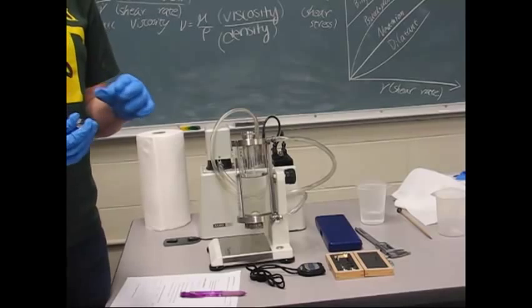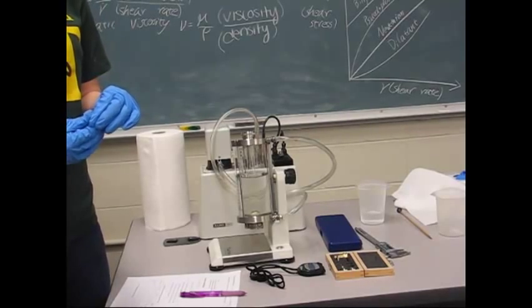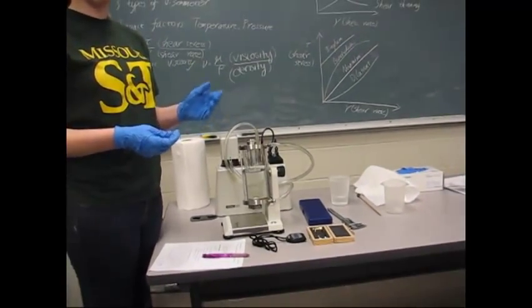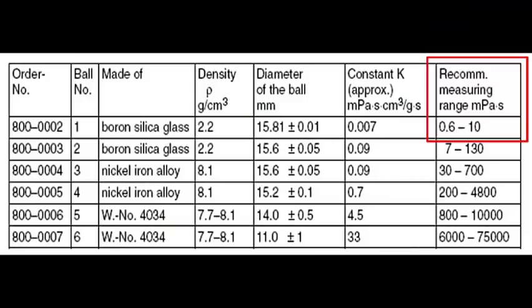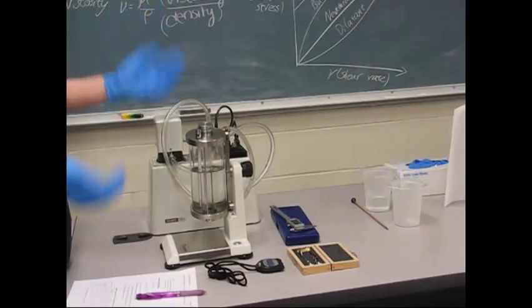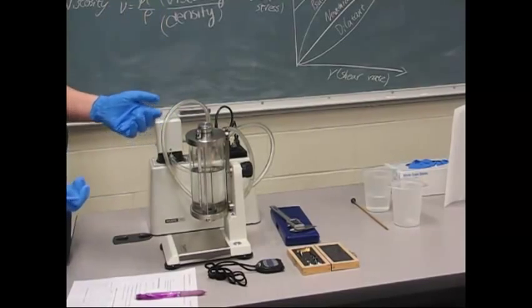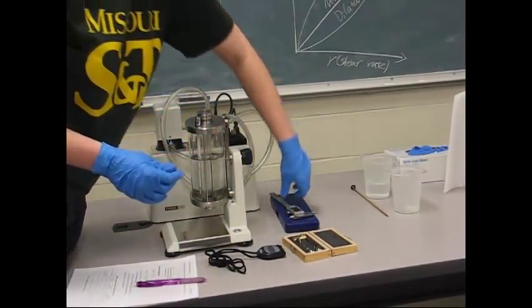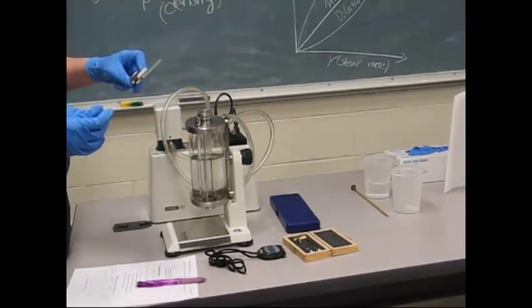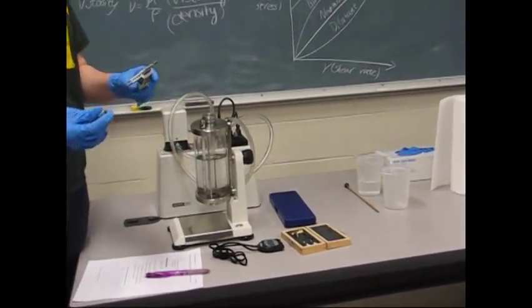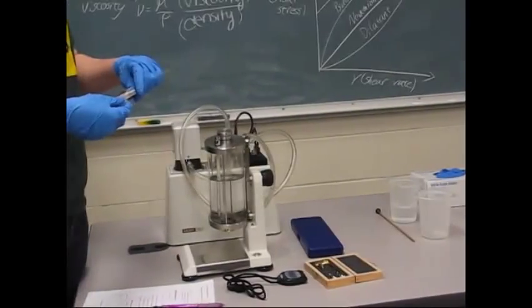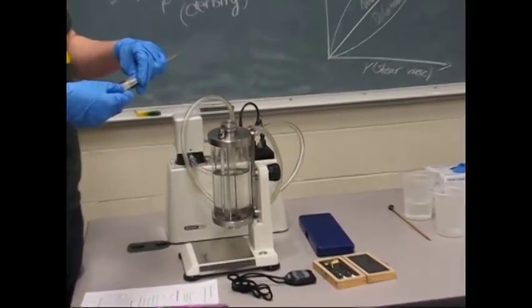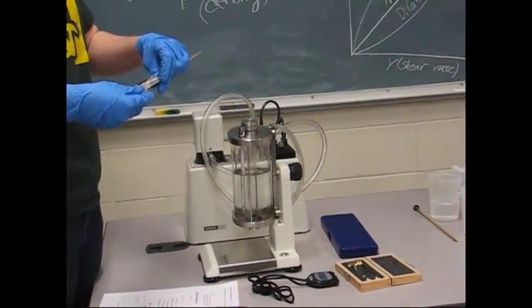If you look at the table, you see that the range where one centipoise occurs correlates with ball one, which has a diameter of around 15.8 millimeters. We're going to run the experiment with ball number one, so we need to figure out which one is ball number one, which has a diameter of 15.8 millimeters plus or minus a couple. So we'll use our calipers, choose a ball, and measure from center, from end to end to see what the diameter of the ball is.